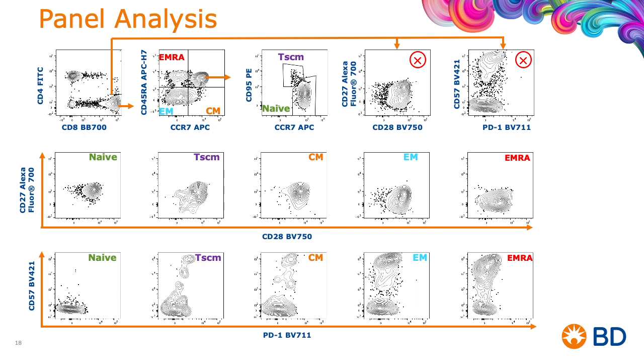And when you can see those red axes there, it's because you can already appreciate that you don't have a good resolution of these markers. You can barely distinguish different subsets that we know exist in this population. Everything is kind of merged together. Really hard to say what's positive and negative.